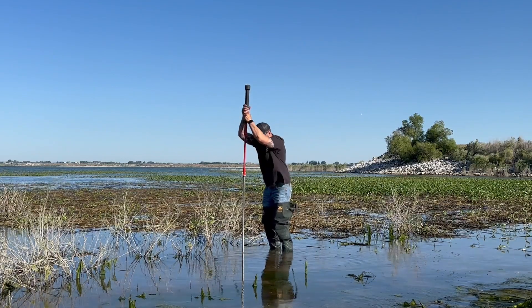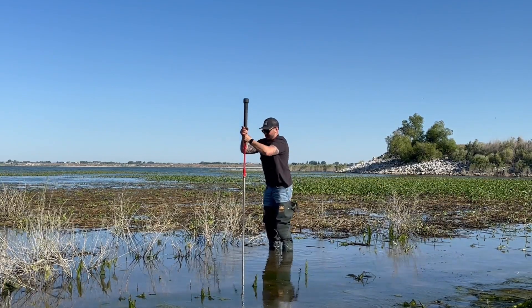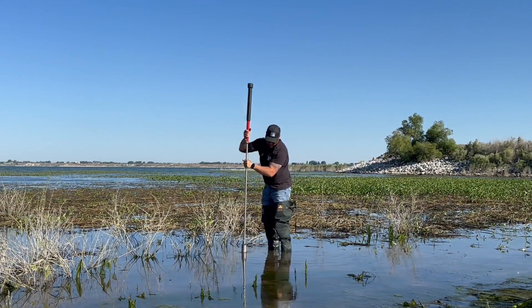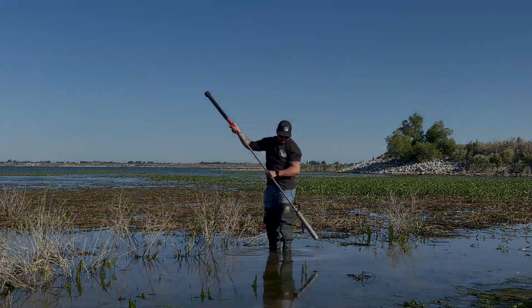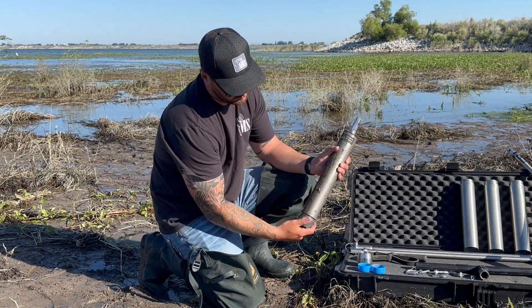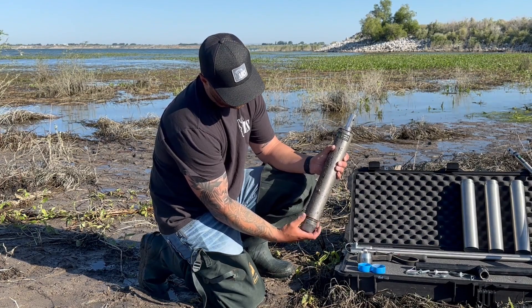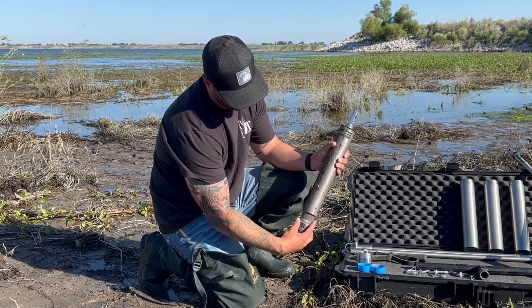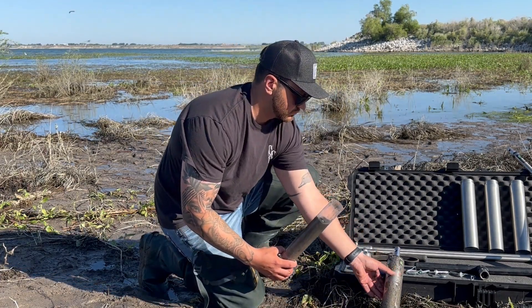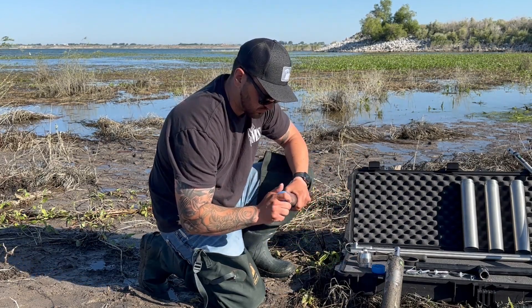Once you have reached your desired sampling depth, you can either pull up on the extension to remove the sampler or reverse hammer with the slide hammer to retrieve it. Start by disconnecting the slide hammer and extension from your sampler. Unthread the core tip from the sampler and carefully pull the liner out of the base. To ensure the safekeeping of your sample, secure plastic end caps to each end of the liner.